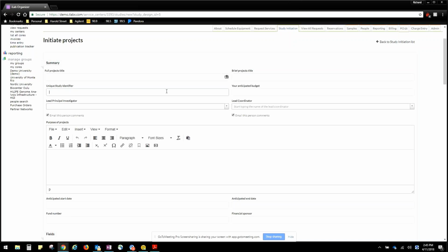So when I say you can toggle them on and off, that might be a better way to phrase that. They're not going anywhere, and they're tied at a study level. So if you had another study, you could obviously use this. But if you didn't want it here, if we went into the admin section, you could actually remove that.